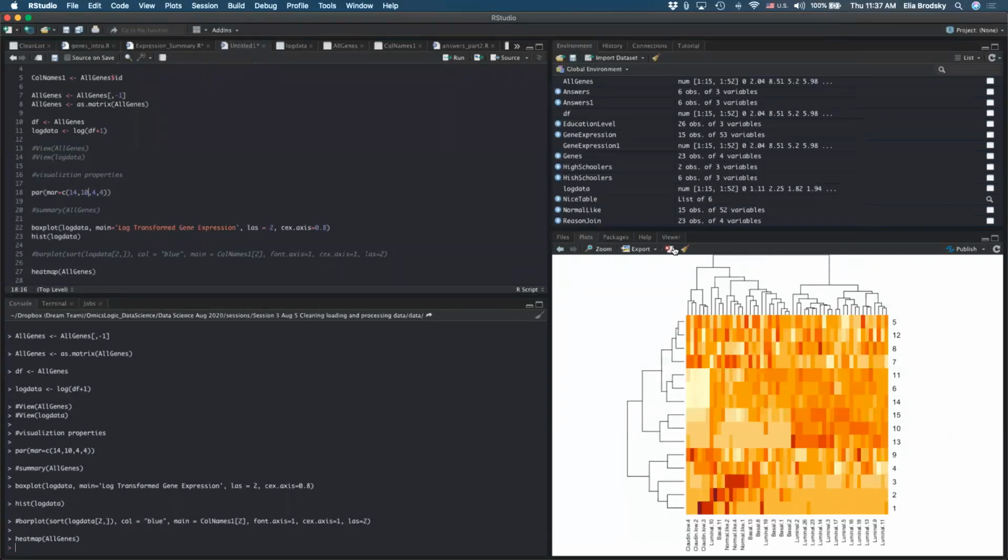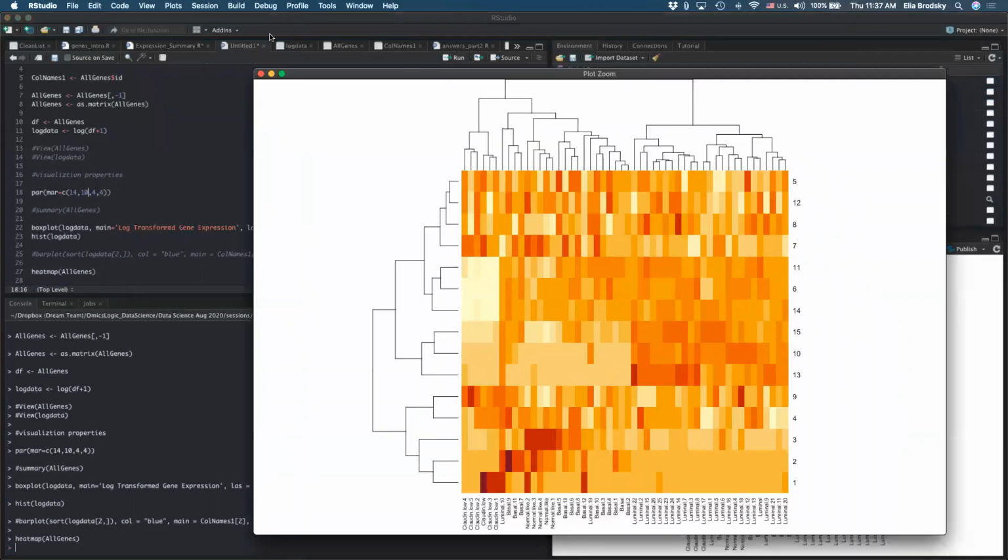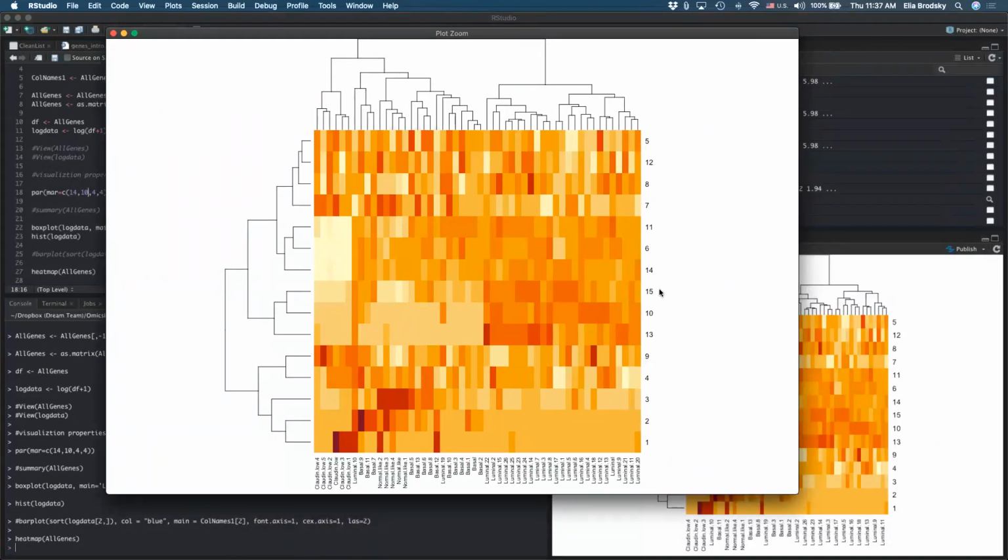Yes, luminal. Well, what do these numbers actually represent? These are the genes. Remember, I have gene 1, 2, 3, etc. So these are my genes, and these are my samples, right? And I'm asking what two groups. Maria and Mark correctly answered that I have luminal. Look, all of my luminal are here and the rest are here, except for this one luminal. Here I have this major group, which is just luminal, and this major group, which is kind of the rest of them.